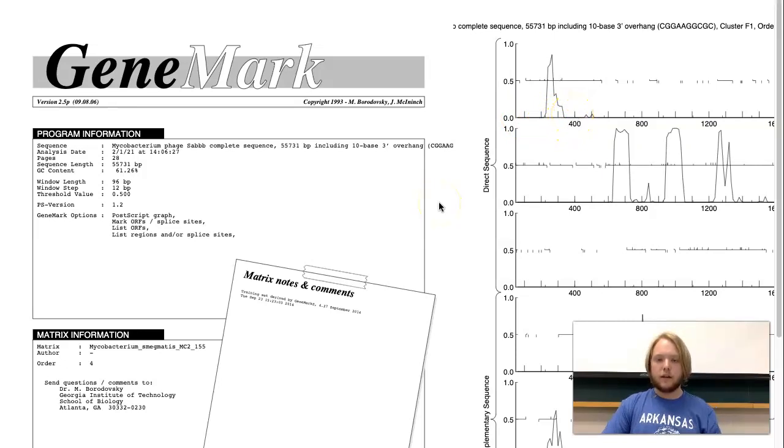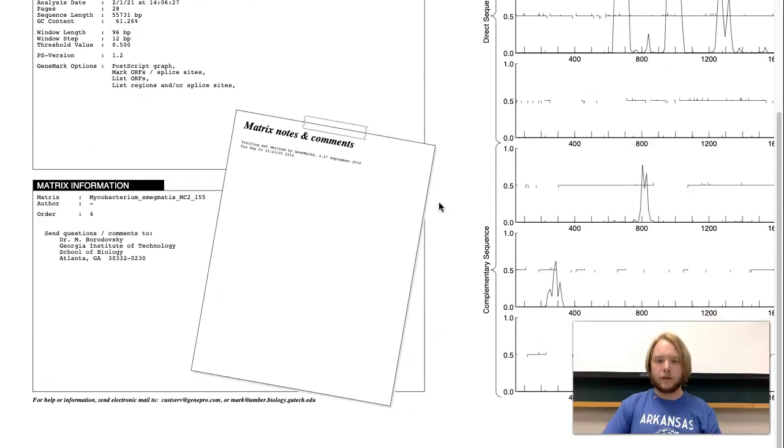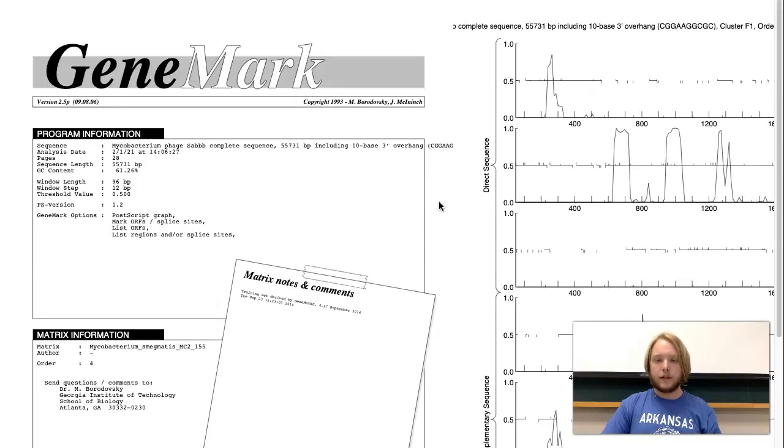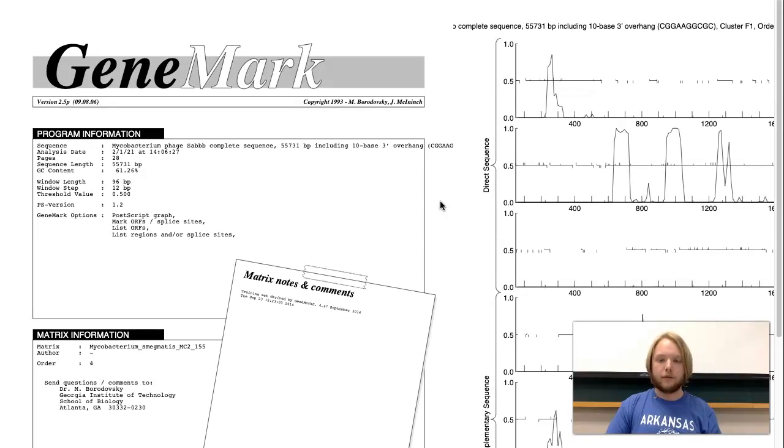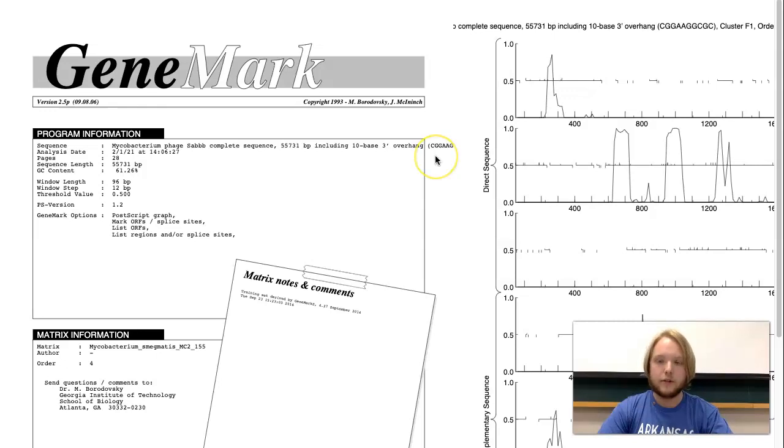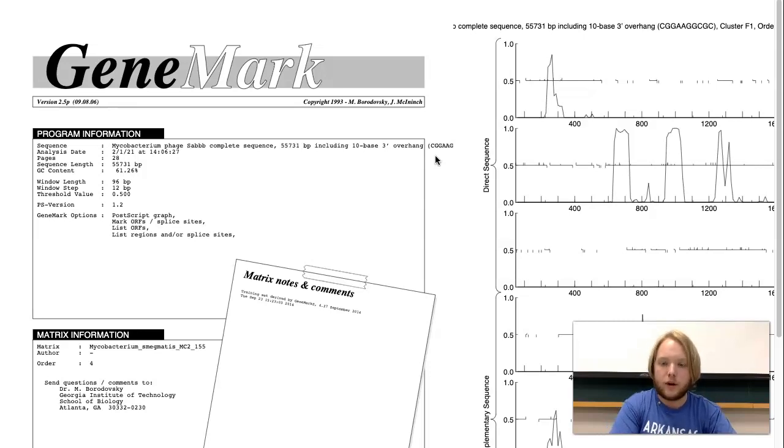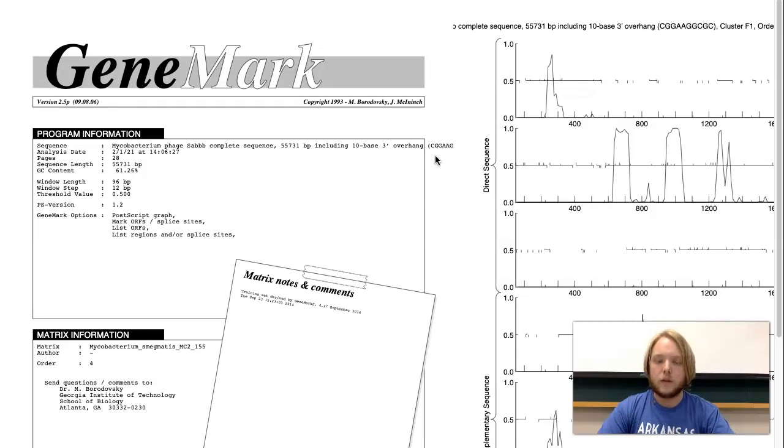Now, you may be confused as to why there are six different graphs here. Each of these is a reading frame. What is a reading frame? Each amino acid is made out of three nucleotides. Each nucleotide is counted as a base pair. However, because there are no gaps inside of a phage's genome, it's just one continuous strand of base pairs, there are a few different ways to read that DNA sequence.